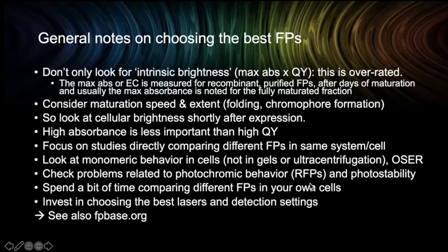Check problems. There are many problems related to photostability or photochromic behavior. Certain red fluorescent proteins particularly switch to blue forms and back and forth. They can be turned off and turned on. It can also be used for super resolution. But in general, for FRET sensors or biosensors, you don't want the fluorophores themselves to react strangely to light.